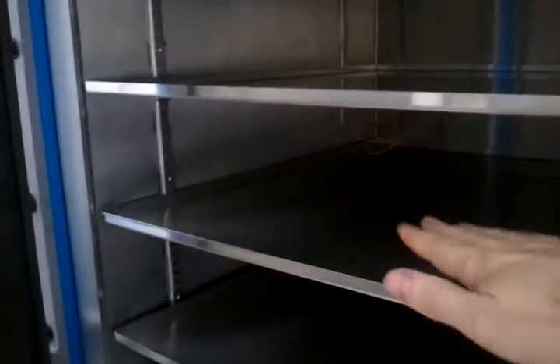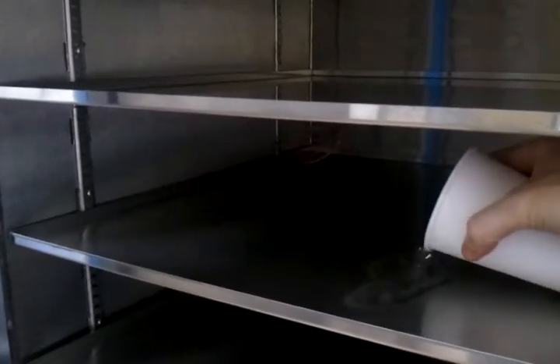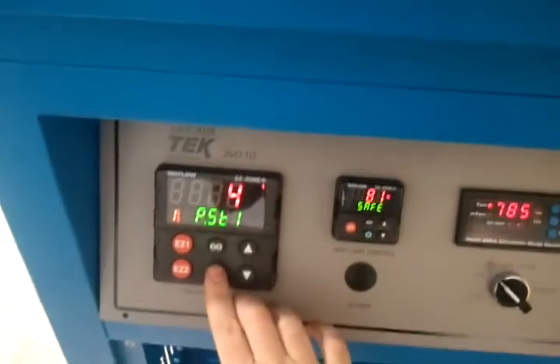I'm going to go ahead and open her up. We've got some nice hot shelves. I've got myself a little bit of water here. Pour some room temperature water on there. Let's go ahead and close it up. Let's get this profile started.